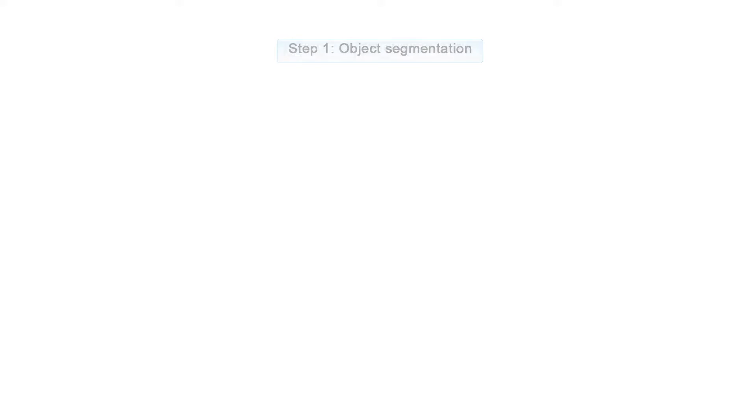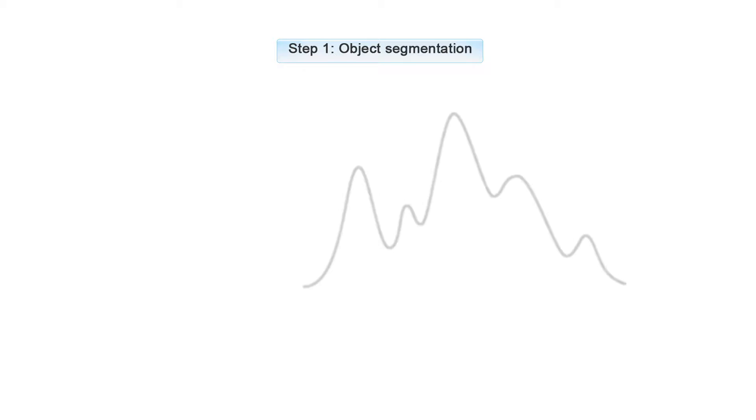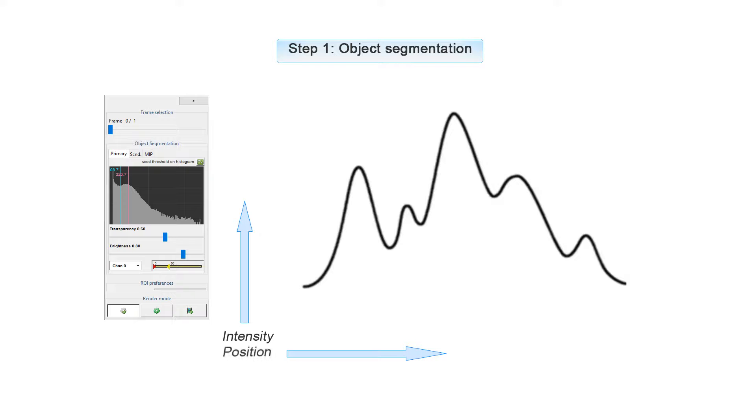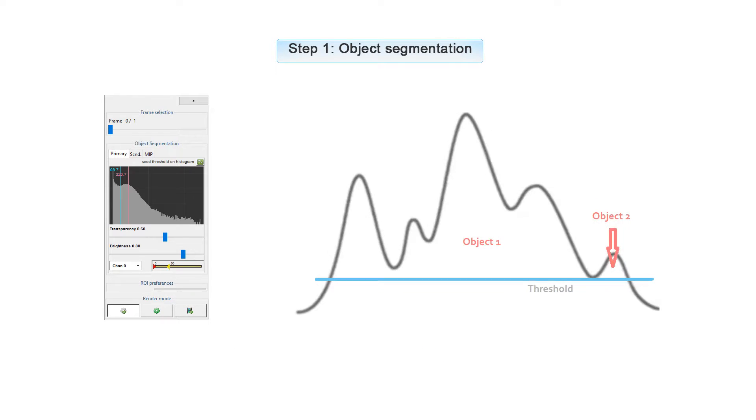Step 1, the Object Segmentation, uses the Threshold Seed Segmentation method. The blue lines represent the threshold, the pink line is your seed. It works as follows: if you have a line profile where the y-axis is the intensity and the x-axis is the position of your voxel, you create objects above the threshold line. Here you can see the two objects that are created when we just use the threshold.